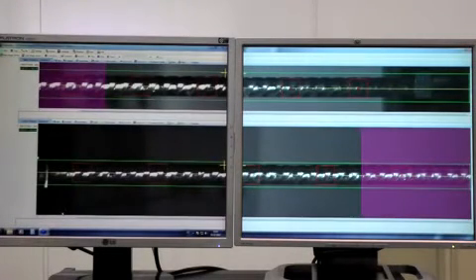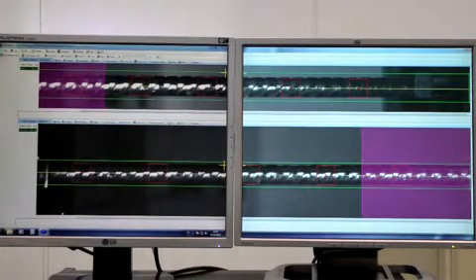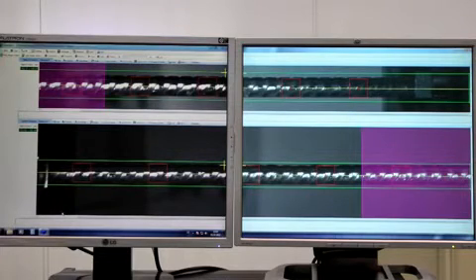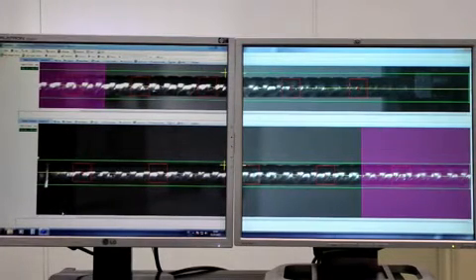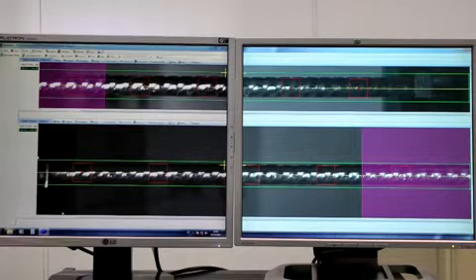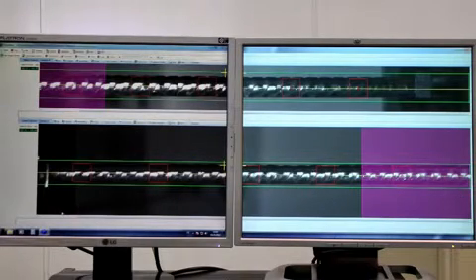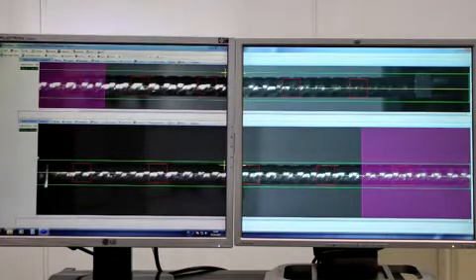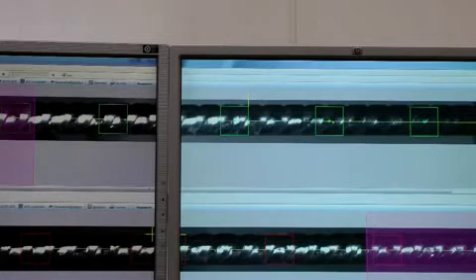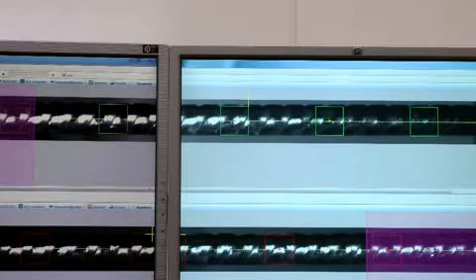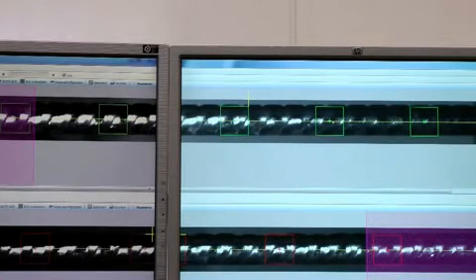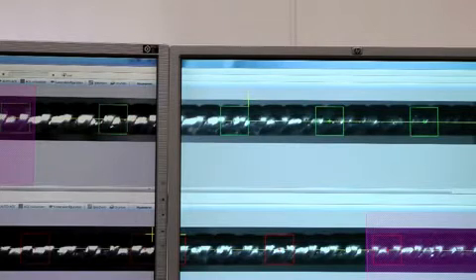When the Video Xtens program is opened and shown on two monitors we can see the total free length of the specimen. Since the Video Xtens measures between each two targets it can determine exactly where the maximum strain occurs at the moment and it marks the used targets green.